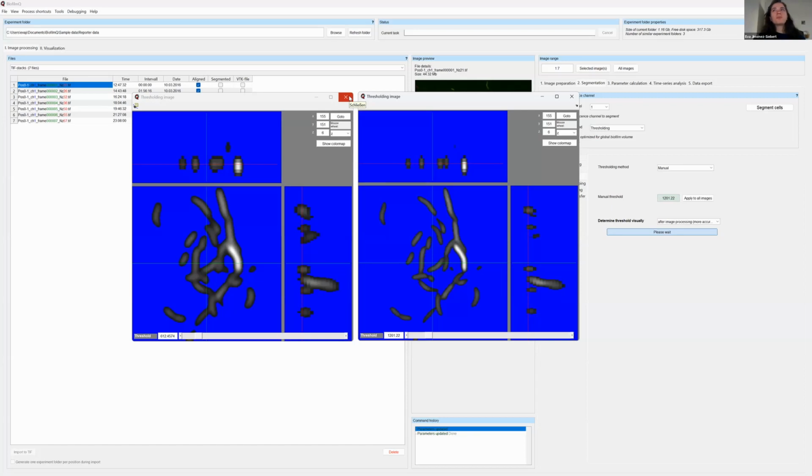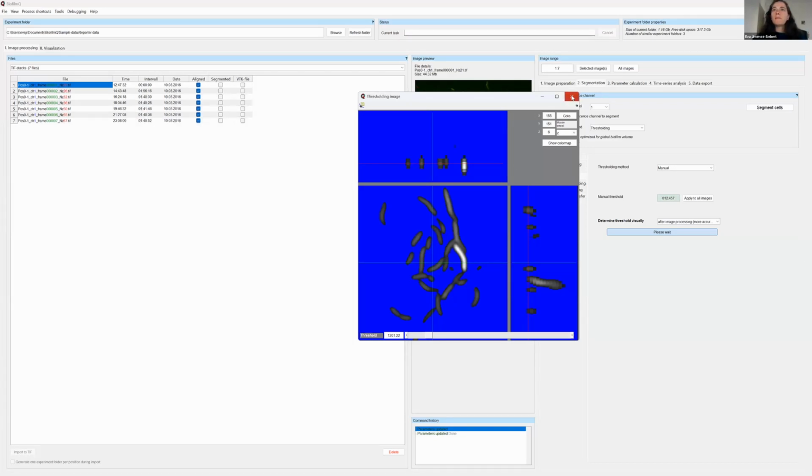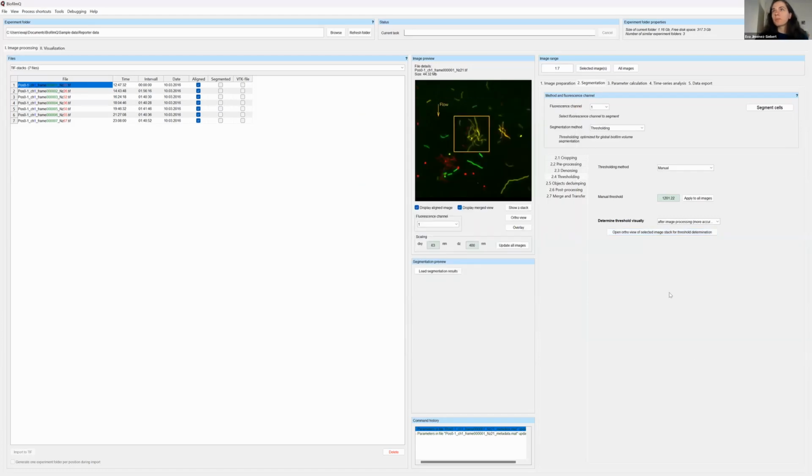But you can also do analysis of the fluorescence on the segmentation of the first channel. I'm not going to go into that today because we don't really have time, but that's a possibility if you're interested in that. Yeah, we can talk about it. I'm going to close this now because I'm seeing we only have 15 minutes left. But that is how you could get a visual feedback on what you're doing in this section.